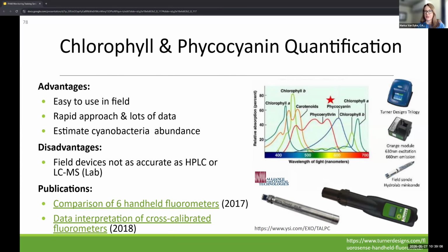Many programs, or even a permit program, require the analysis to be done in a lab. Then you're going to be using liquid chromatography, like we talked about for toxins as well, or benchtop fluorometers, again performed in the laboratory. This is a really useful measurement to be employed. It's also used to verify satellite imagery for detection of blooms. And there are some links to guides on the strengths and weaknesses of each of these different technologies to integrate into your programs.